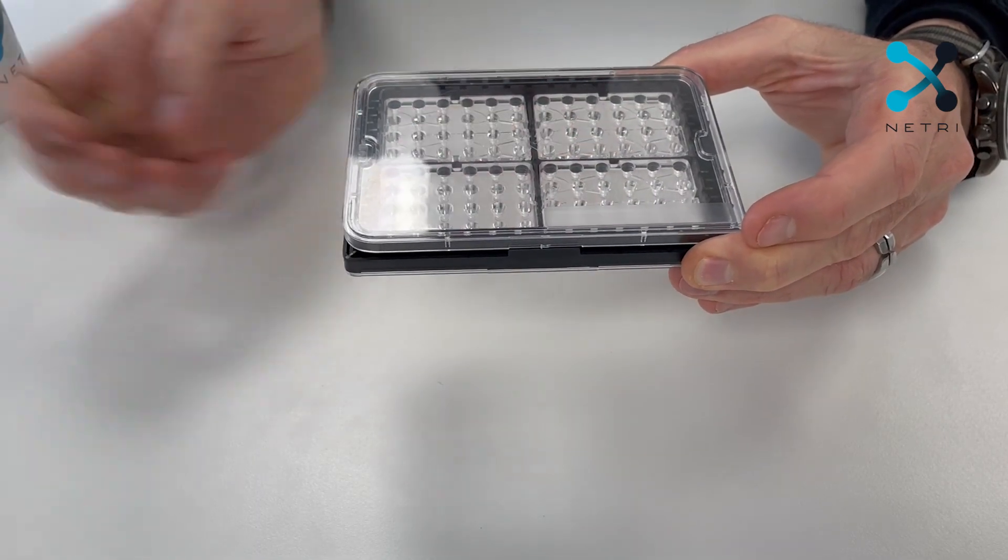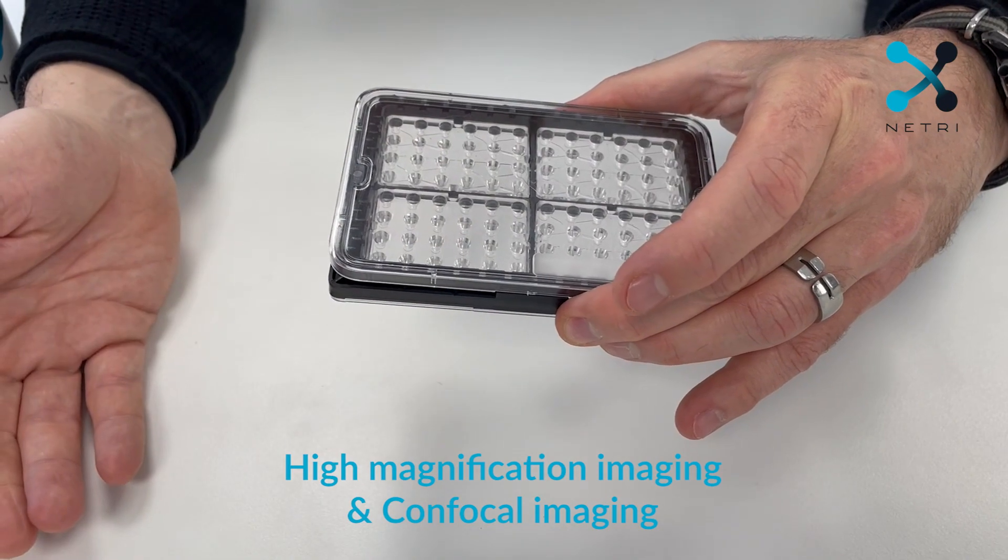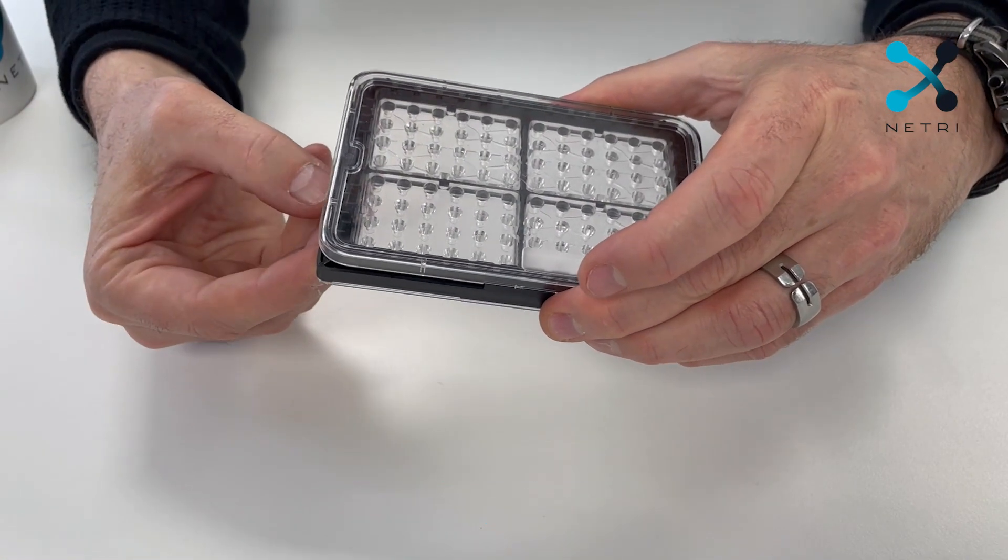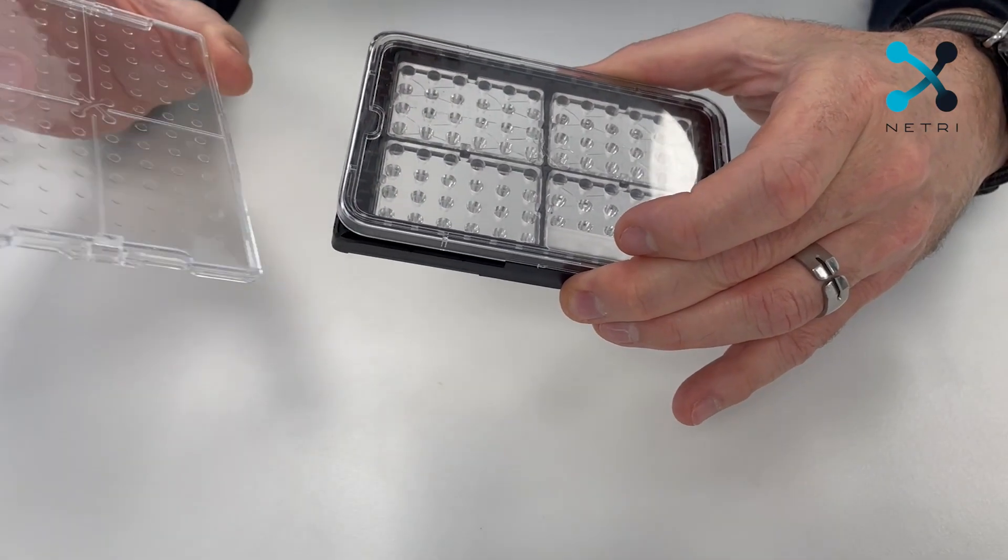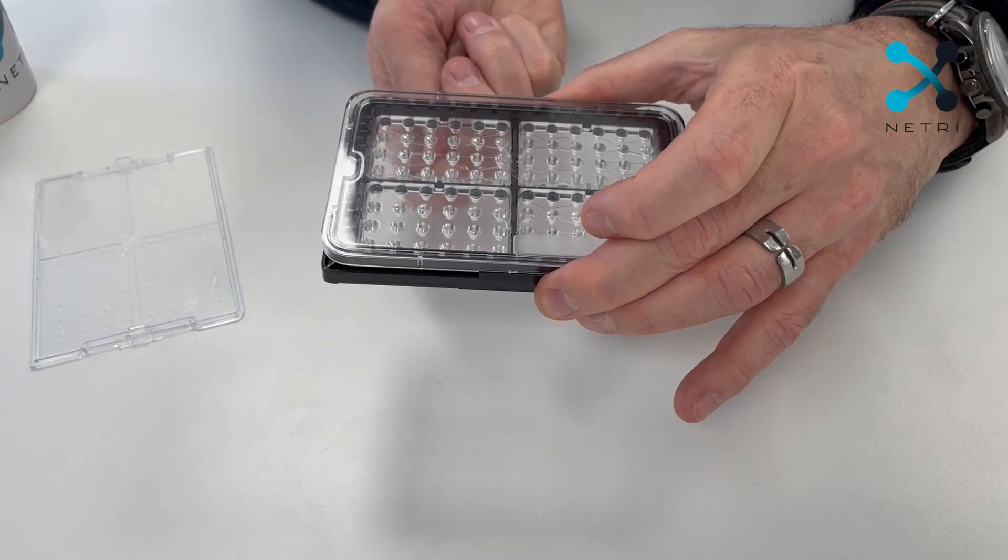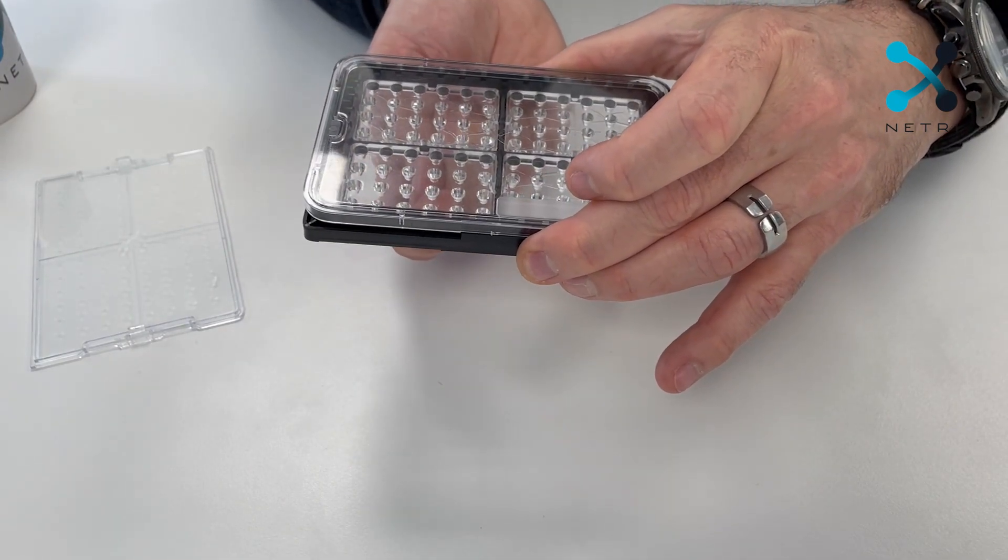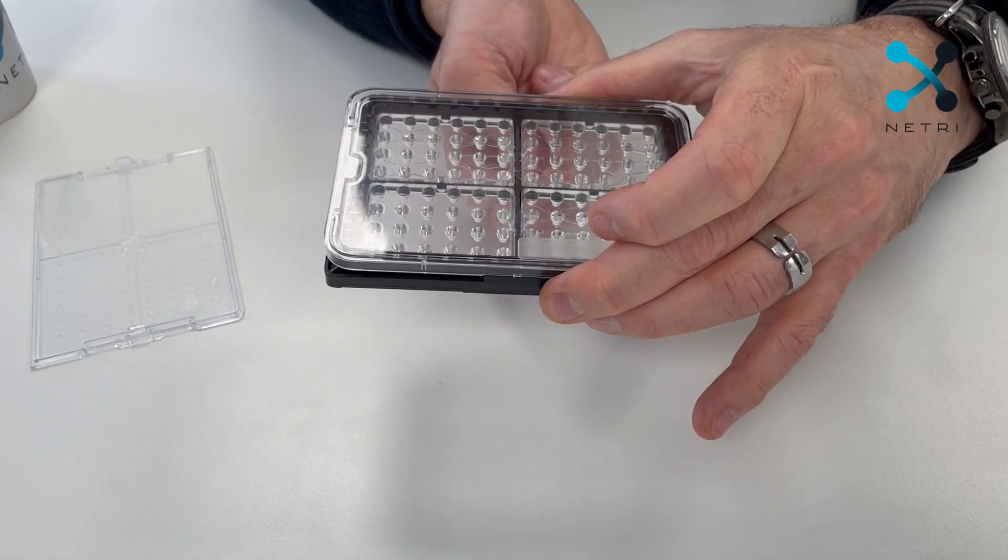Now if you want to do higher magnification or even confocal imaging, here's the little trick. You can remove the bottom cover and this allows you to get right close, about 200 or 170 microns from your area of interest and get those really crystal clear pictures that you need.